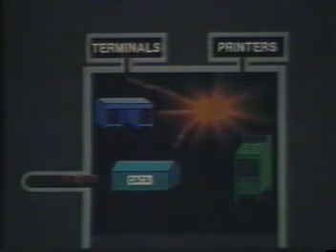When the Magic Secretary receives the second execute command for a sample, it instantly copies the information from the collection label onto a card and places it in the analysis drawer. At the same time, the Secretary opens the FACS interface to start the data flow. While the data is being collected, the warehouse tells the Magic Secretary where the data for each cell is being stored. The Magic Secretary, in turn, keeps a record of these computer language addresses on the new analysis card it created for the sample. While all this is going on, the Secretary will also keep Tom's terminal posted as to how many data points have been collected and how fast the data is flowing.